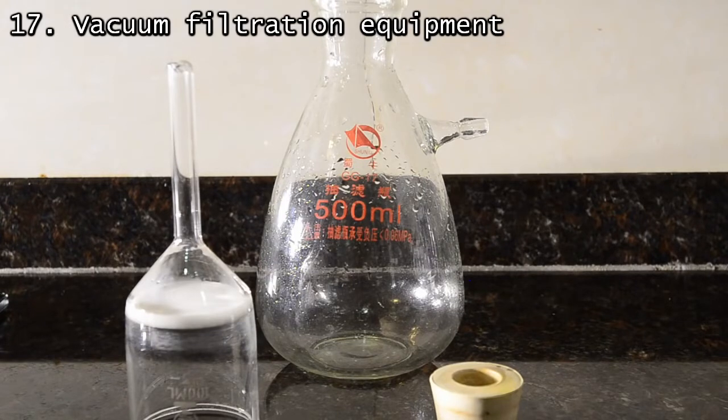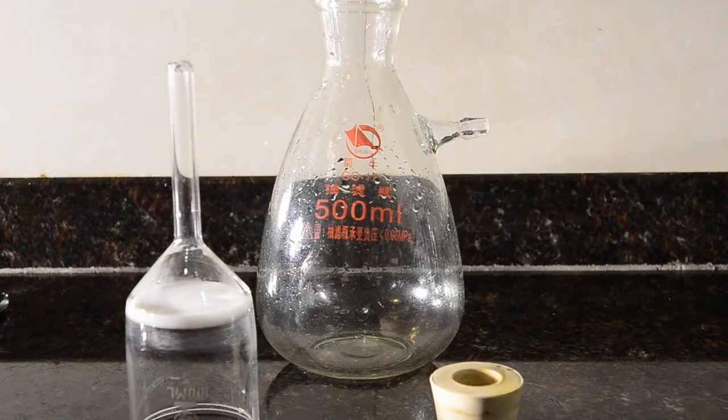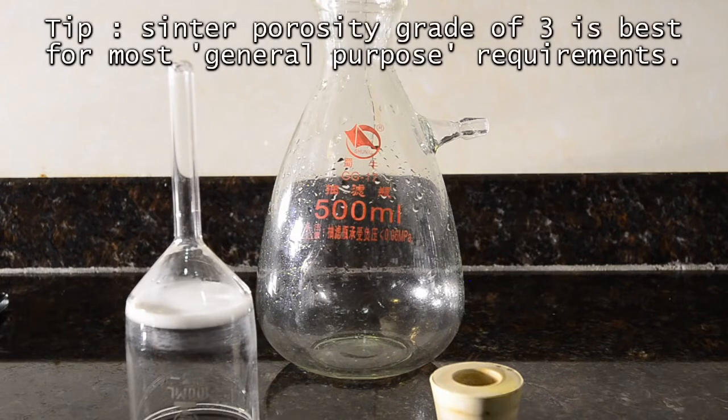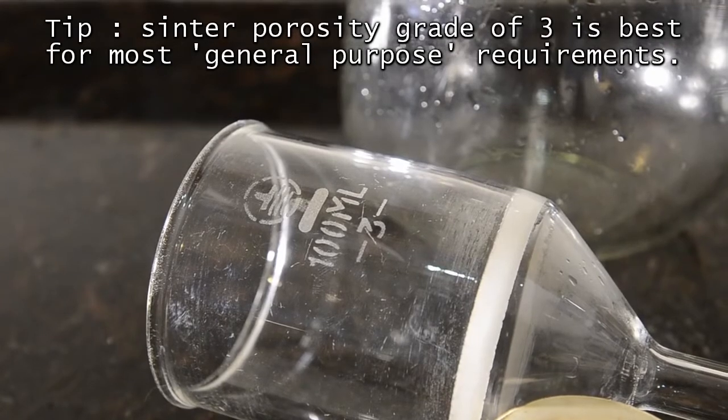Aside from a vacuum pump, you need a thick glass filtration flask — ours is 500 ml. You also need a rubber stopper with a hole in it, and then a funnel or sintered glass filter. The sintered glass funnel shown here is the one we use most of the time, and it has a porosity grade of 3, which is what you want for most situations.